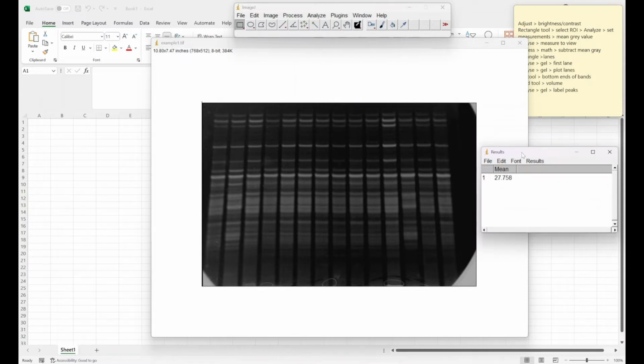Now, background removal via this technique assumes that the background level across the entire image, left to right, up to down, is exactly the same. There's been no changes, there's not some areas that have been blocked better than others. There's not any kind of lighting discrepancies within your gel doc device that means there's uneven lighting across your gel.